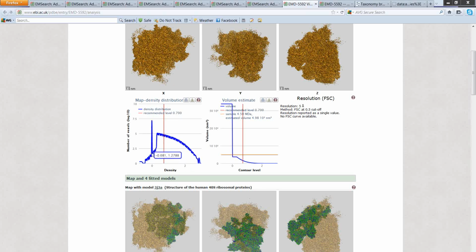For example, a spike at 0 often tells you that masking has been done to this image. You have a discontinuity in the density here, which could be because of some sort of thresholding. You also have an oscillation here, which is quite unusual. We don't normally see this type of oscillation, but it could be due to some sort of bit compression taking place.